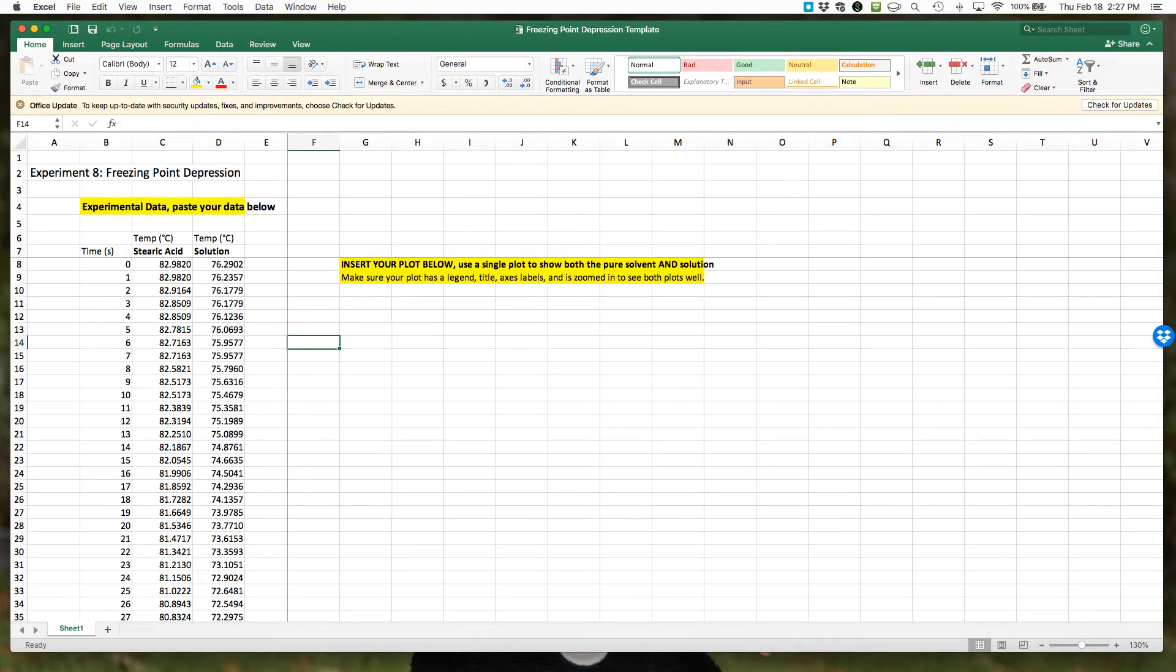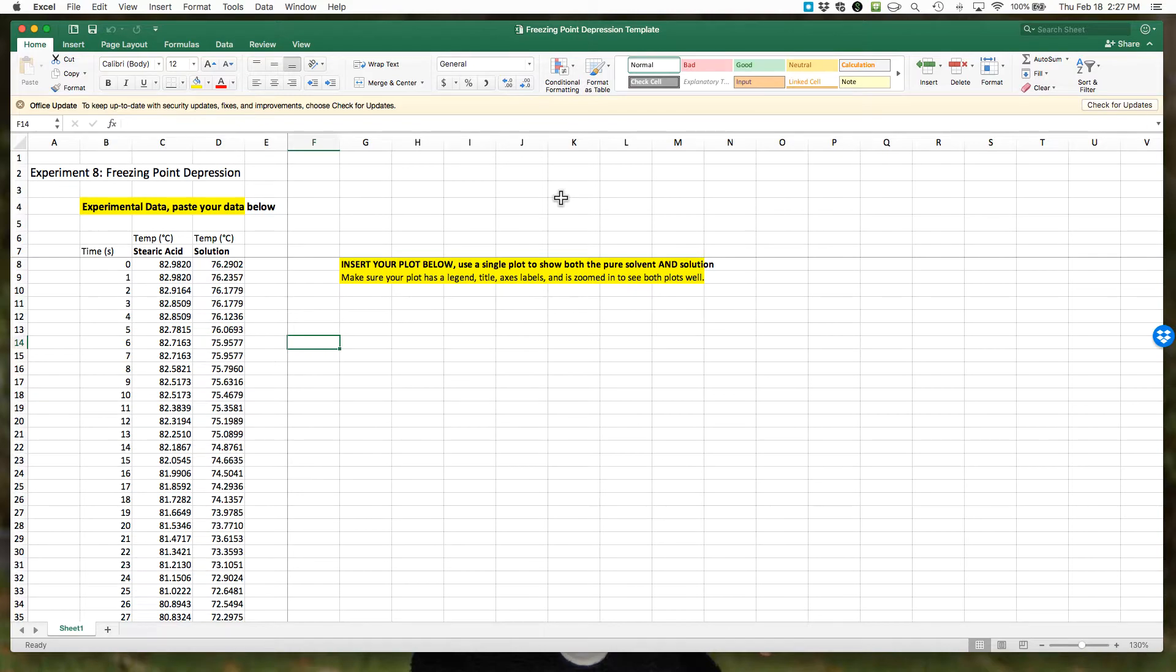If we follow the steps on the Google Doc for our data analysis, the first thing you should do is save and rename this file. Then we're going to enter the data as we have.